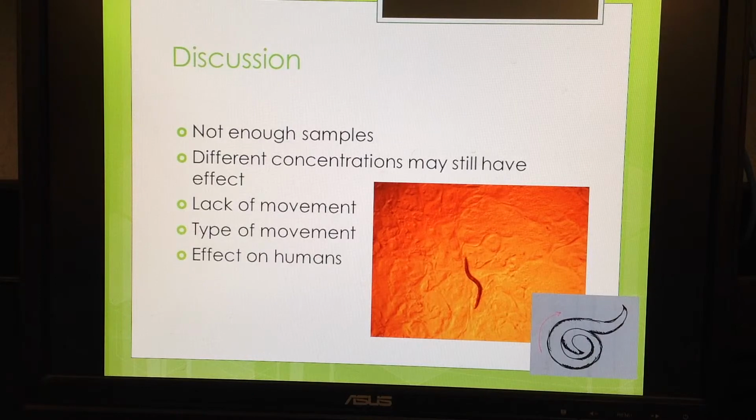Using 30 worms for the entire experiment, we did not generate enough data from our sample sizes for each concentration to prove any kind of link mathematically between the lifespan and use of fertilizers on C. elegans. Our recommendation would be to use at least 30 worms for each individual concentration to generate more data. The low, medium, and high data appeared like a bell-shaped curve with survival rates of 30, 70, and 50% respectively.